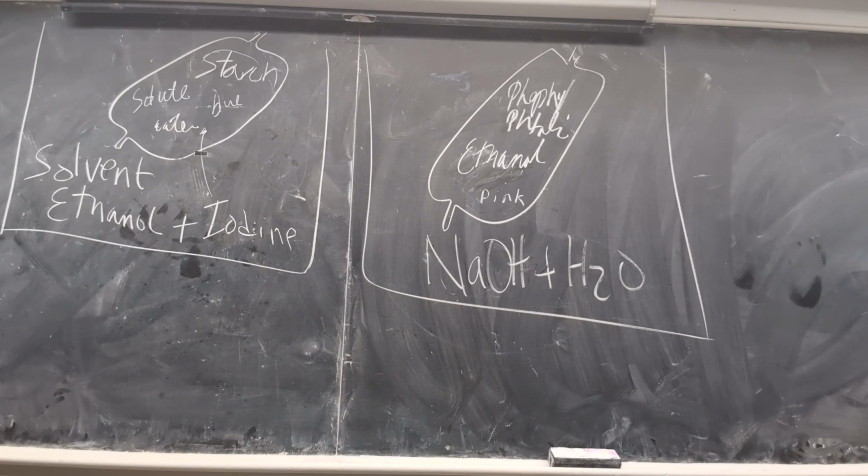So now, yeah, you can take your question. Go there. Take ethanol. Fill it with like 3 milliliters. Ethanol is right there.